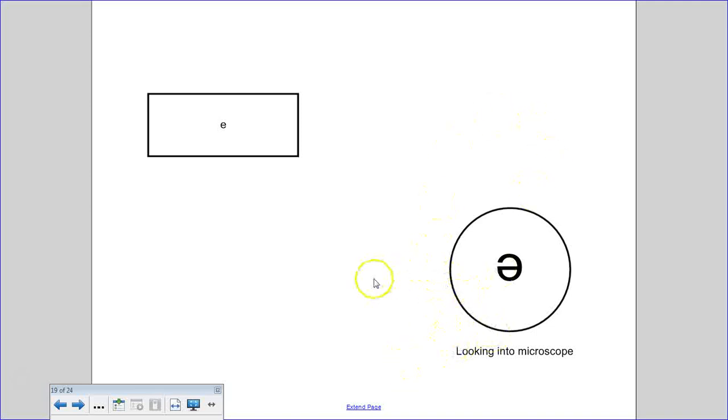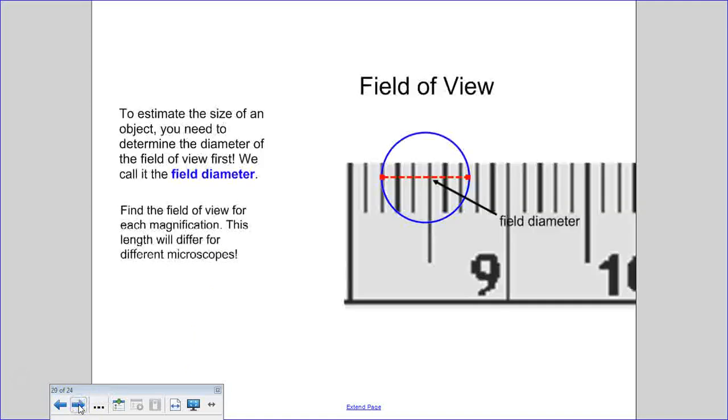Sorry. Okay, so that's kind of how things move. So there will be questions in the assignment, I think. There might have been one or two about moving things. How would you move it so that you can get it in the right spot? Opposite.